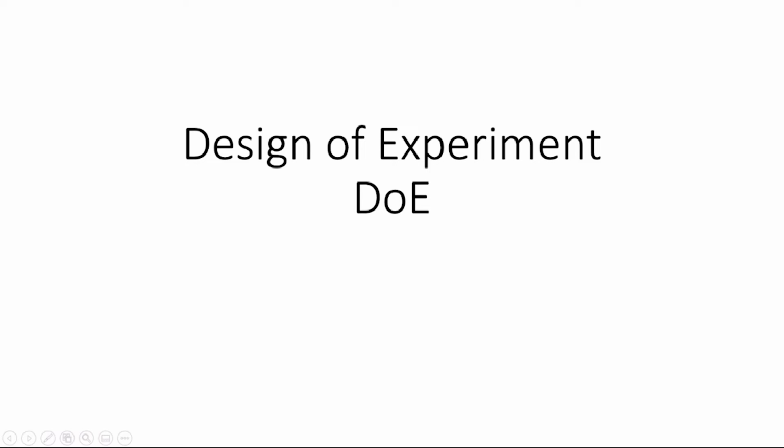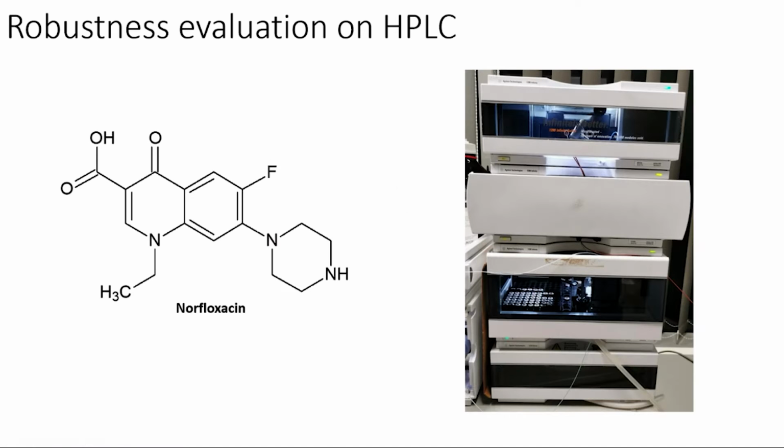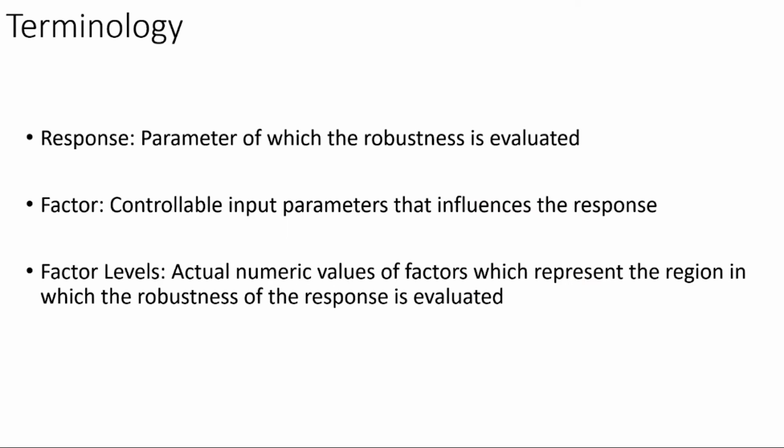Hello, and welcome to this introduction to design of experiment, in short DoE. We're going to take a look today at the example of a robustness evaluation of an HPLC method based on the substance of norfloxacin. But before we start, we need to consider some terminology first.